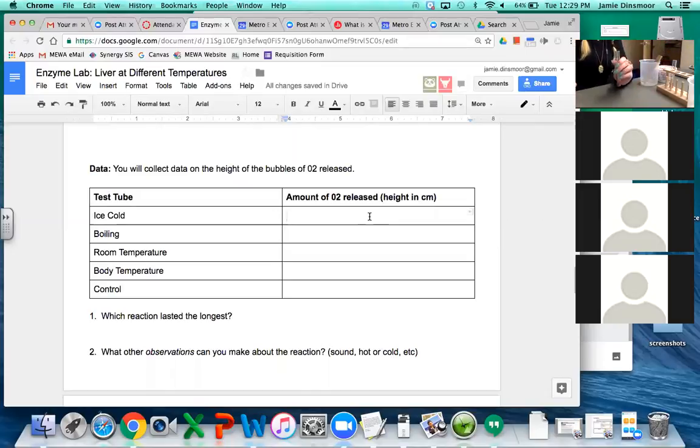Okay, so I need someone who's going to come stand really close to me because they're going to measure the bubbles here. I'm not really good at measuring, so don't look at me. No one wants to measure the bubbles? All right. No one does it, I'll do it. We need you. Just hold it. I'll help you measure it. Okay, I'm going to try not to let my hands get in the way.